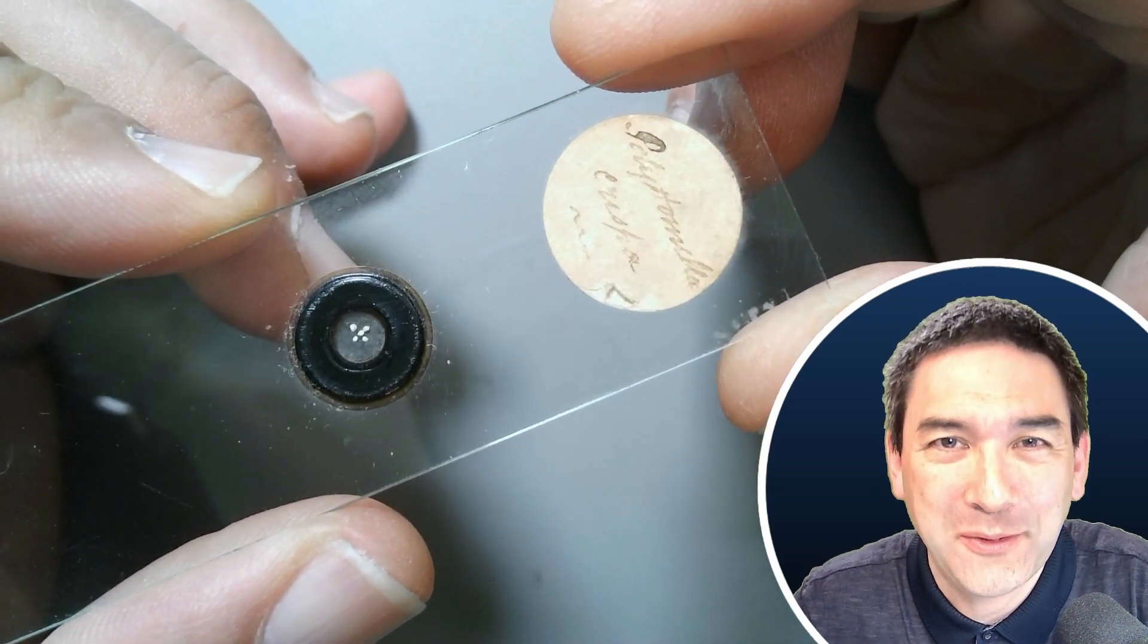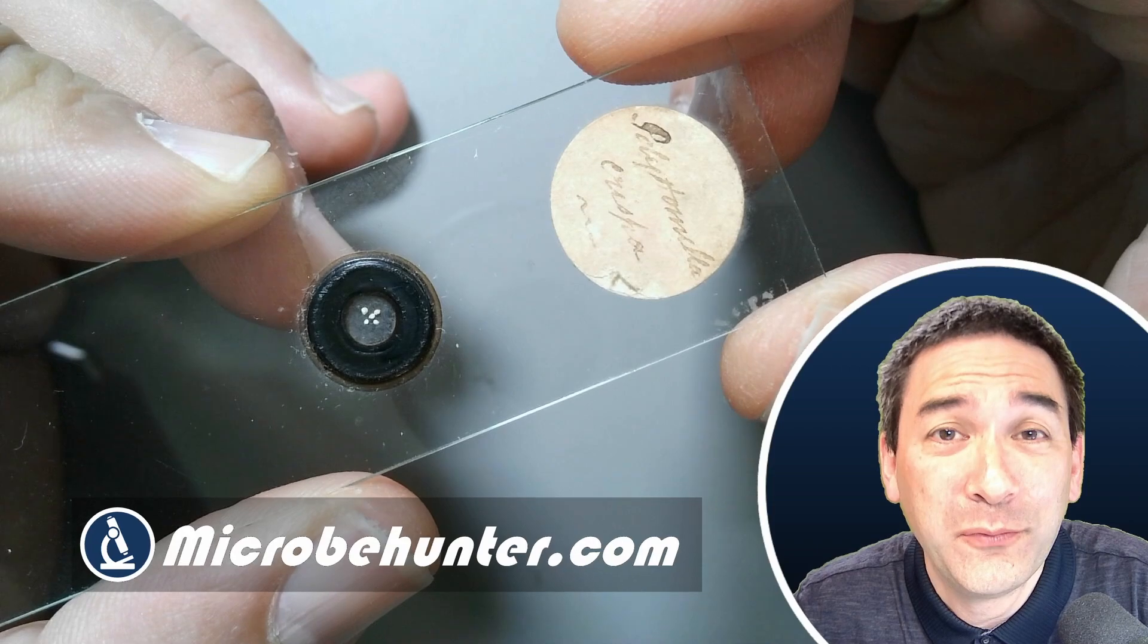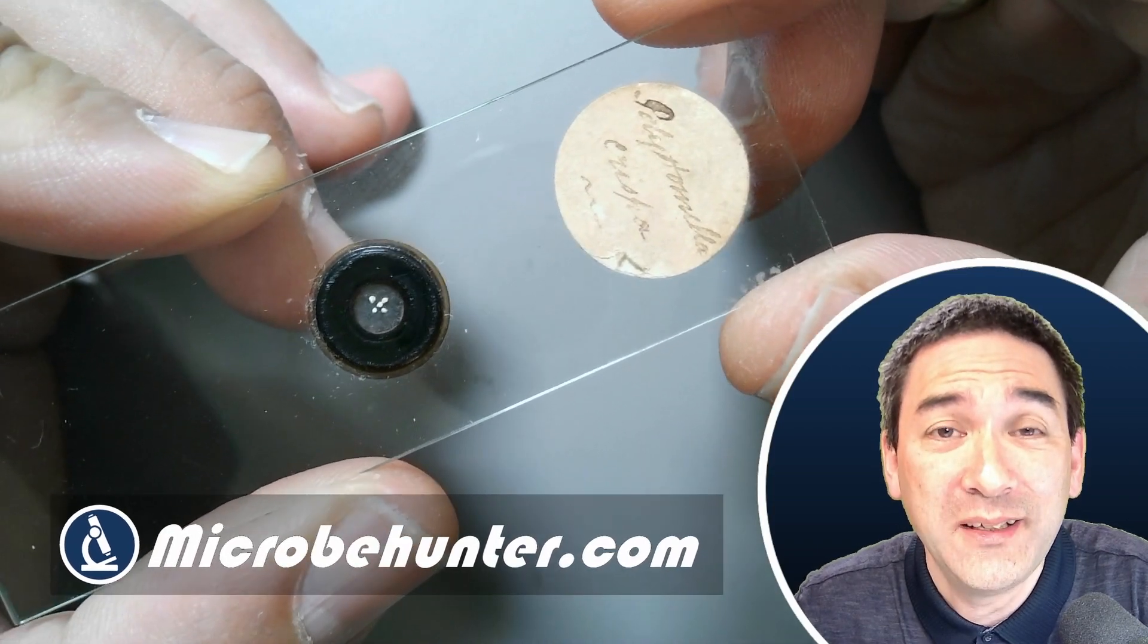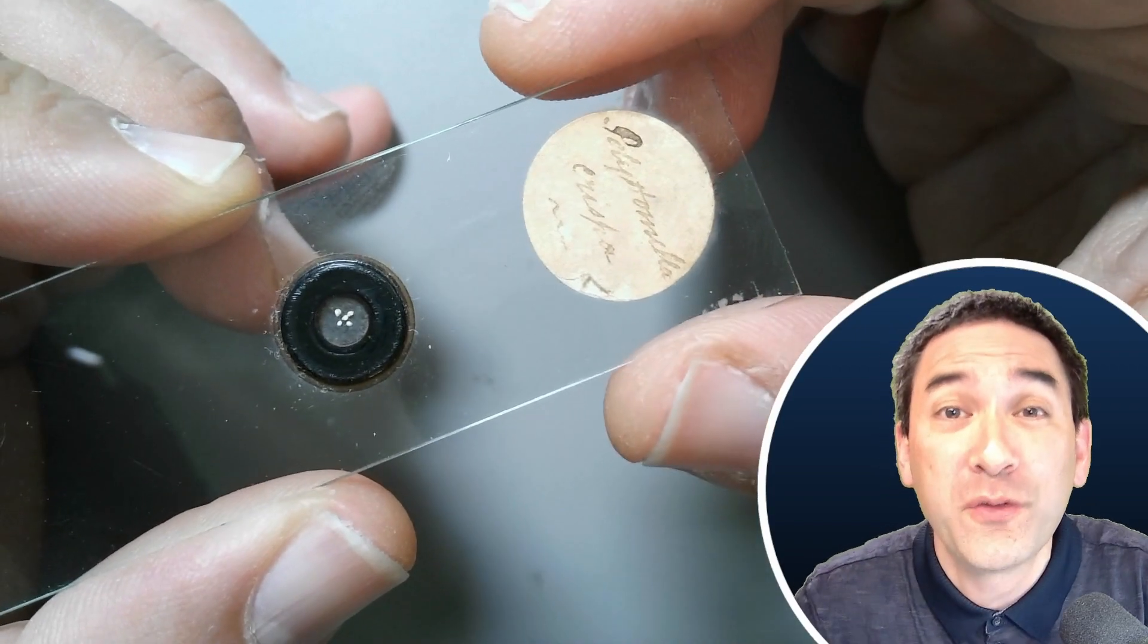So hi, hello and welcome, Microbe Hunter here. Today I would like to show you this beautiful antique microscope slide. It contains the shells of foraminifera, or also known as forams.